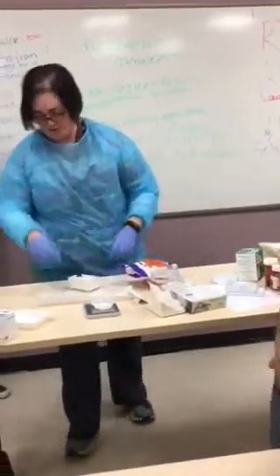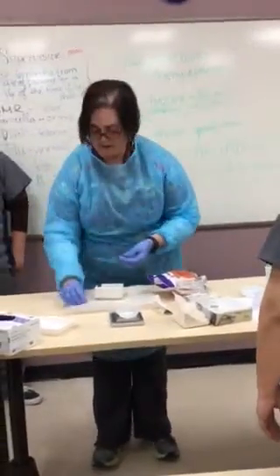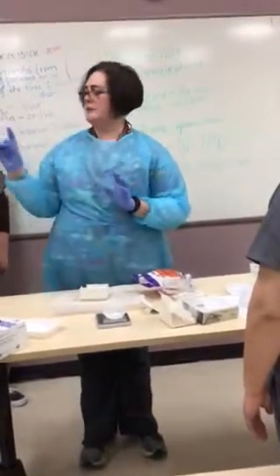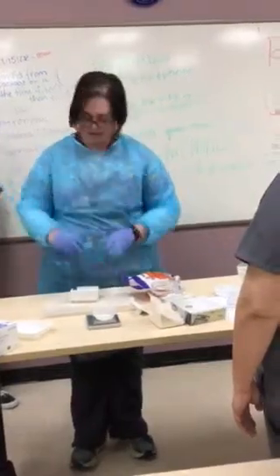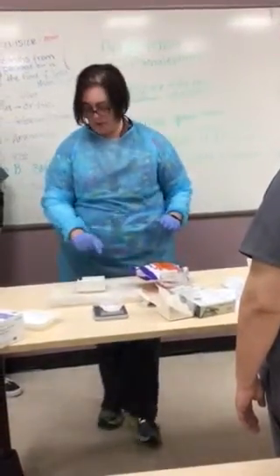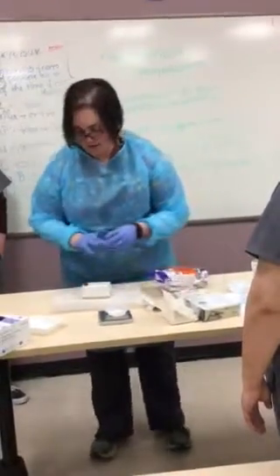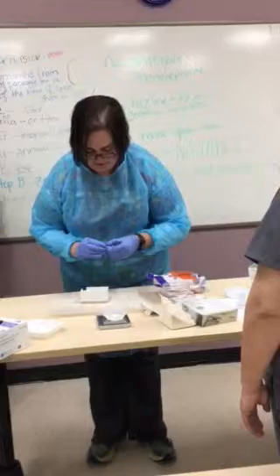Itchy nose, which is going to be on the video. So I'm going to pull my capsules apart and I'm going to put my tops here. We need the bigger one in here, and I just push it in — not all the way in, just to where it's even with that. You're not going to be able to see it until you flip it over, so give me a few seconds.